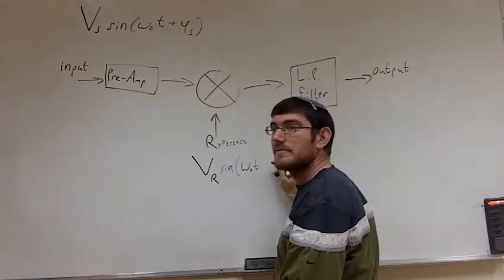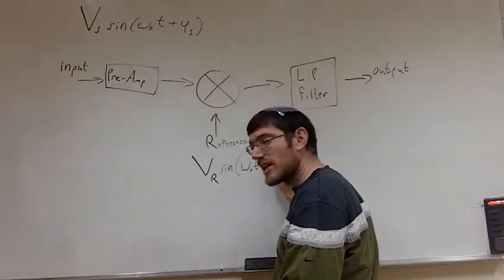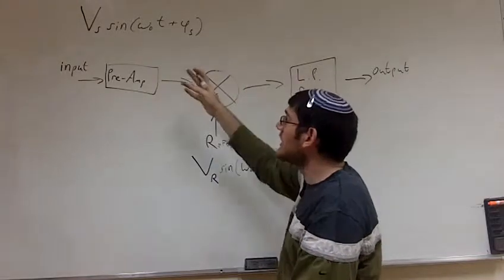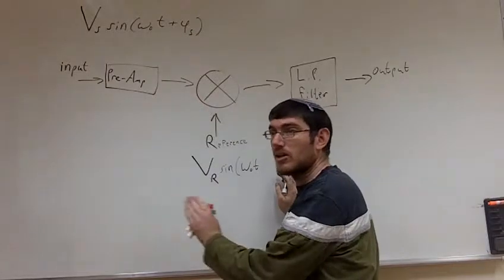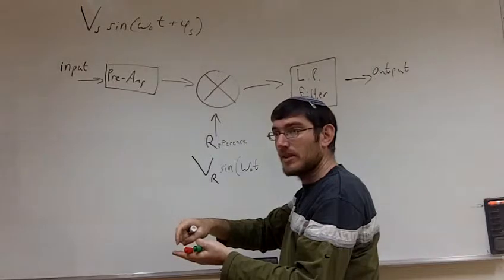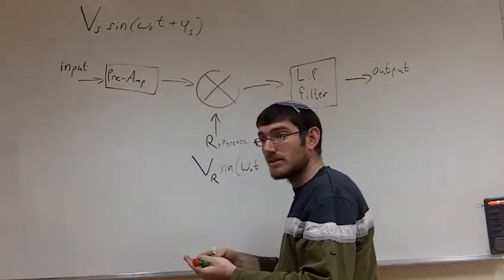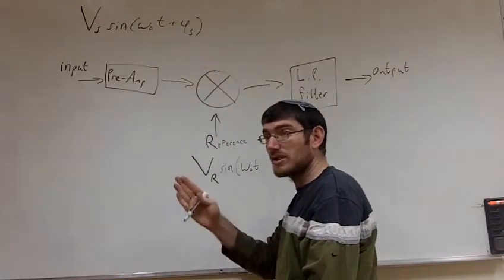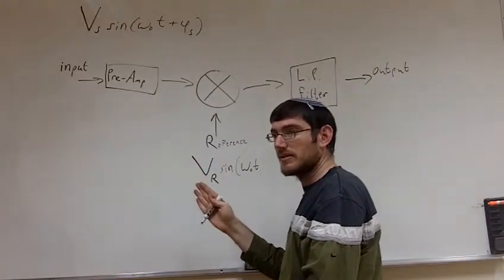But the input frequency is variable according to the sample characteristics, right? It will change a little bit. You're right, but we know more or less the frequency. We're going to only look at one frequency, not at other frequencies. It's true that when the tip is in contact with the sample, there are going to be external forces which change and give extra frequencies. But we're looking only at one very particular frequency, the resonance frequency. We're not looking at other frequencies.